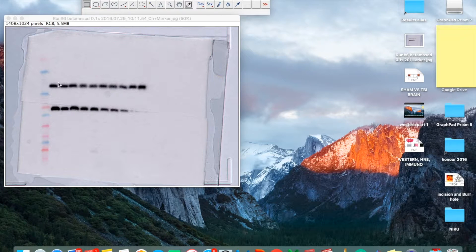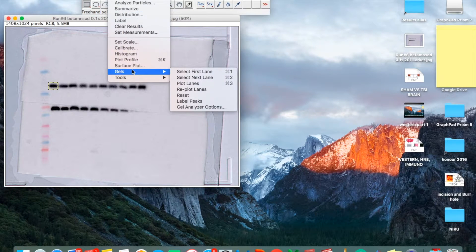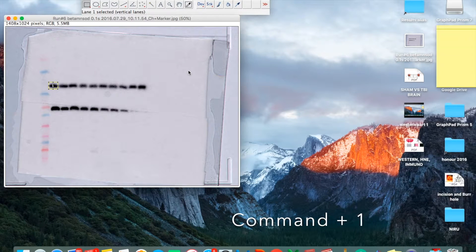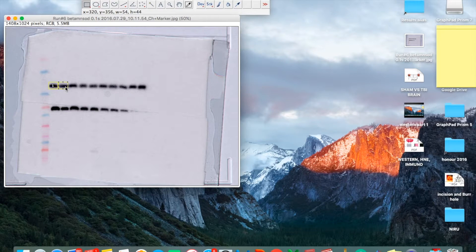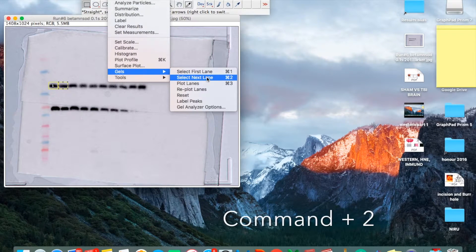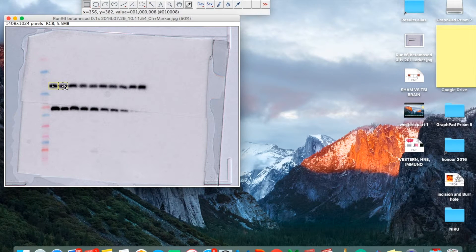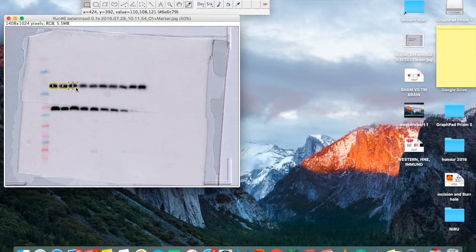The first method is to select individual lanes. Use the rectangular tool to select the first lane. Once you select the first lane, go to Analyze Gel and select the first lane. Now drag to the second lane and go to Analyze Gel, select the next lane — you can do Command 2 or on Windows Control 2. Again drag to the next lane.